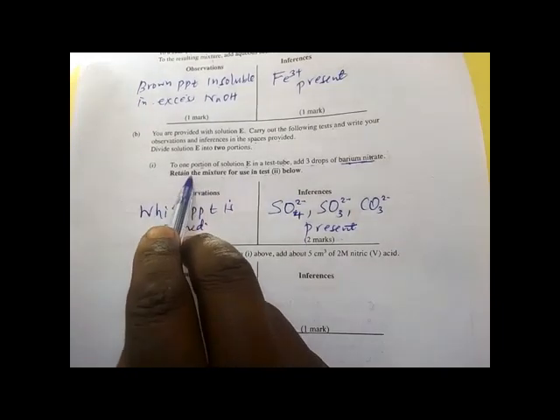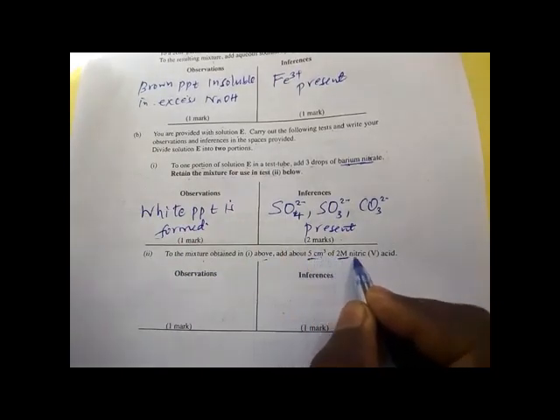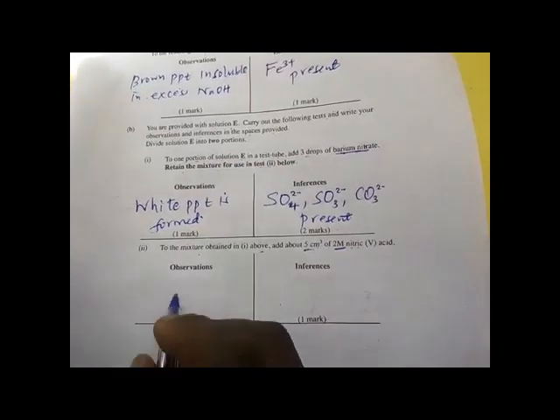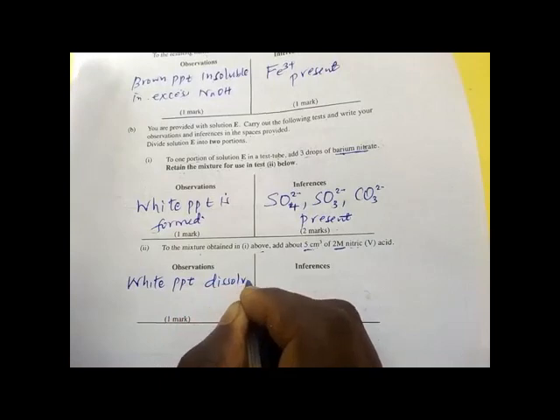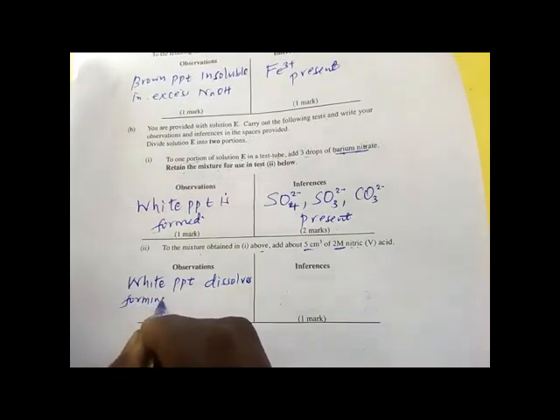So to the mixture we retained here, add 5 cm³ of 2 M nitric acid. Then the observation is that the white precipitate dissolves, forming a colorless solution.